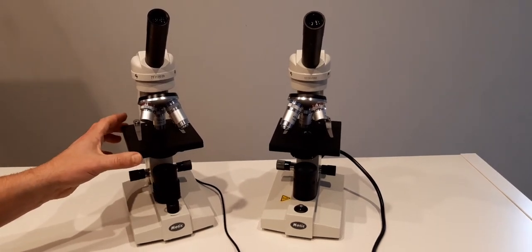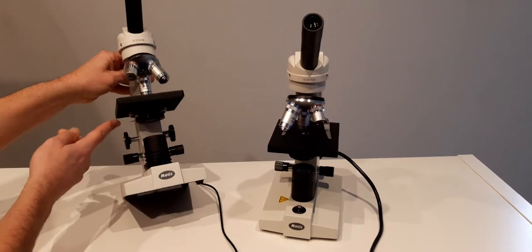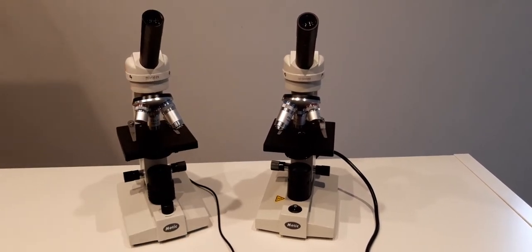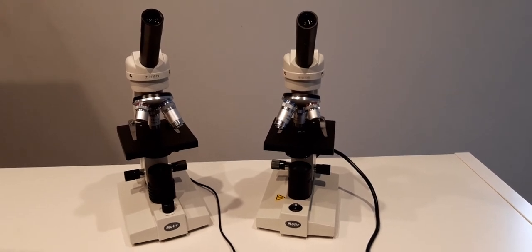Here we see a plain stage with condenser. The iris diaphragm allows the user to regulate the amount of light on the specimen.